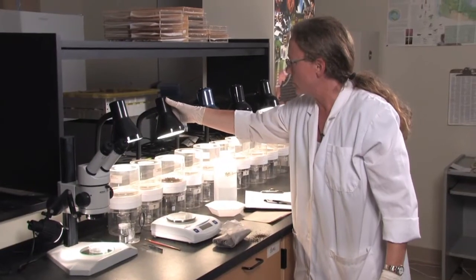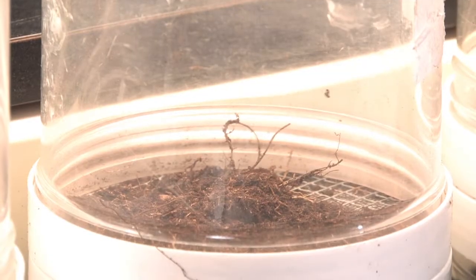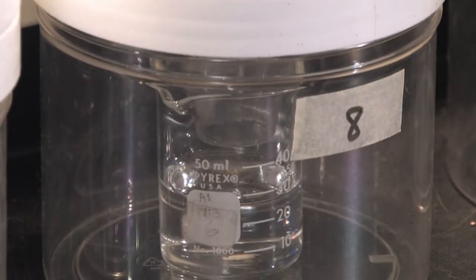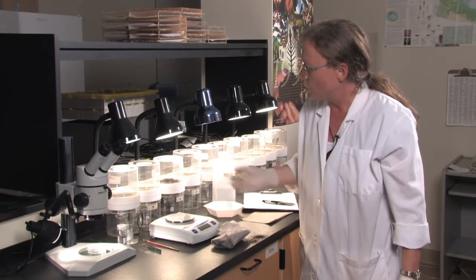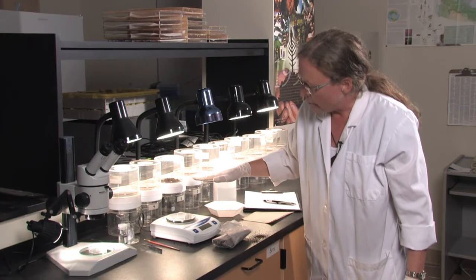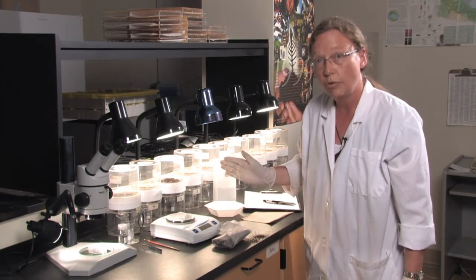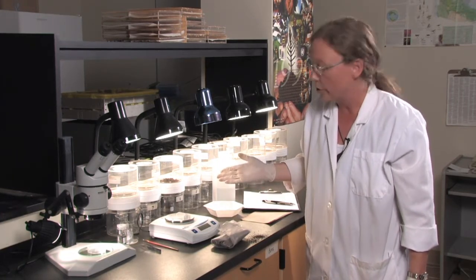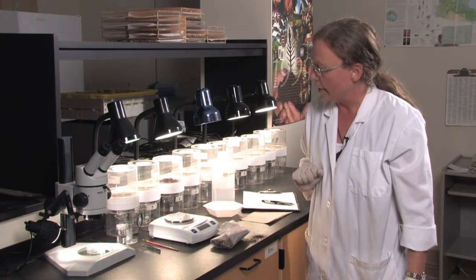What we are trying to do is drive the microarthropods down through the funnel into the distilled water using the heat source and also the lack of moisture. Over the course of one week, we should have all of the microarthropods down in the distilled water and the soil sample should be completely dry. Sometimes this can be done after four days, depending on how wet your soil is.